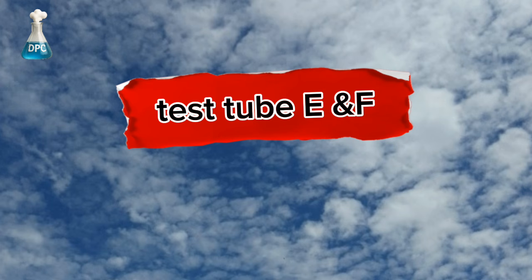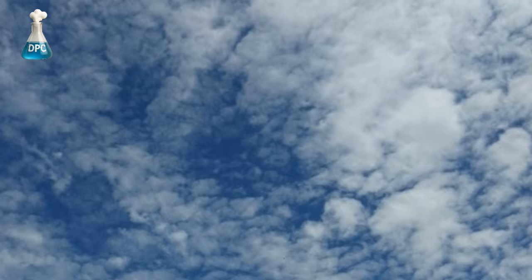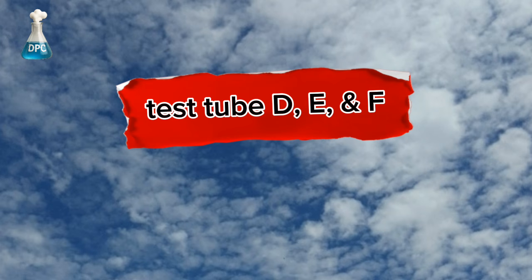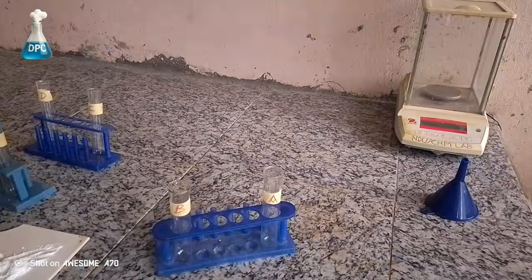Now the first 3 test tubes A, B and C will contain sodium hydrogen carbonate, while test tube D, E and F will contain acetic acid, vinegar. We can start the experiment now.